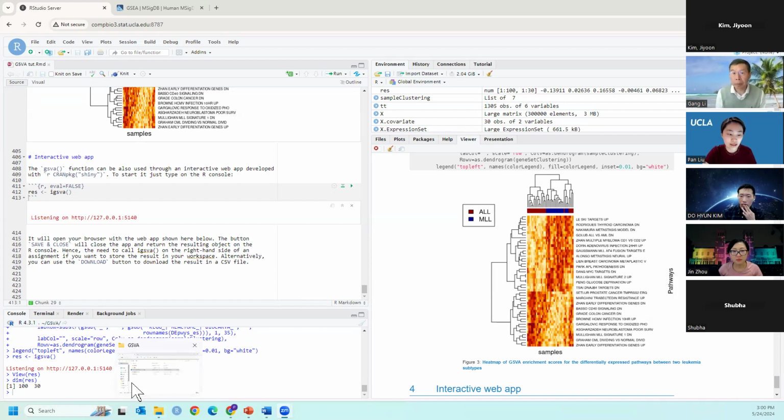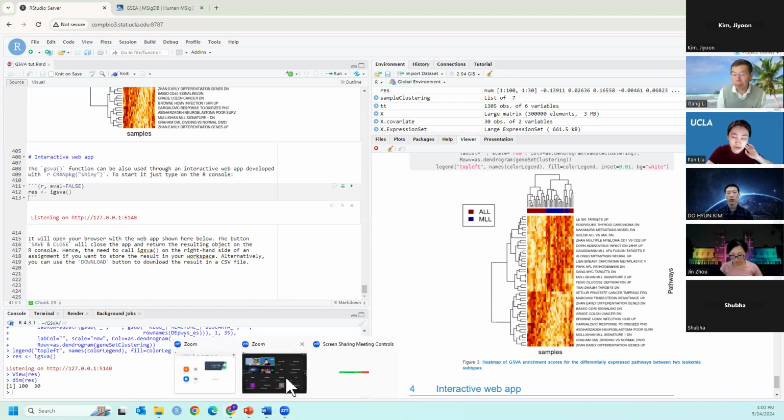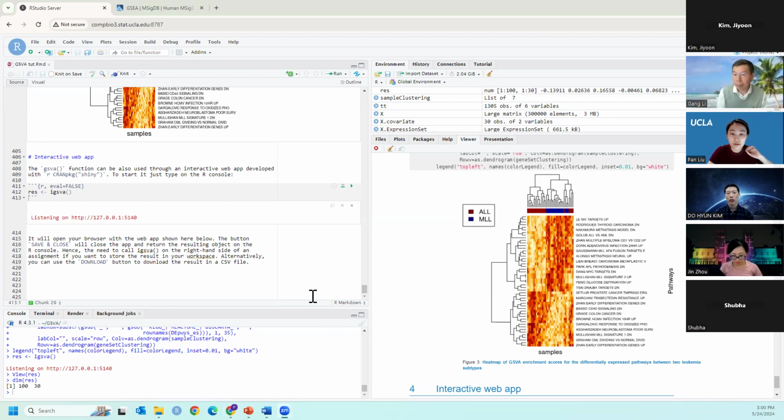All right, I thought I answered that question. You just asked that question in the chat box, right? Actually, I think for Seurat, there is a function where you can obtain the assay or slots of the Seurat object, right? Mm-hmm. I'm wondering whether GSVA has something dedicated. No, it cannot directly work with the Seurat object. You need to extract the matrix first and then feed it into GSVA. Okay, got it. Thank you. No problem.